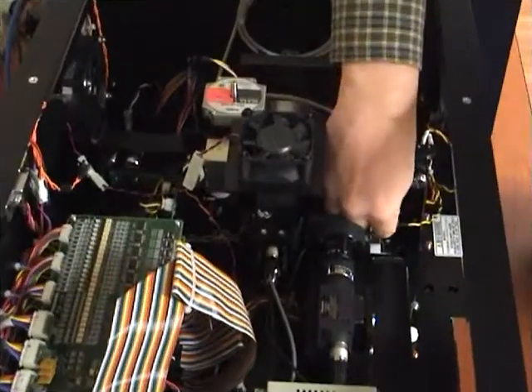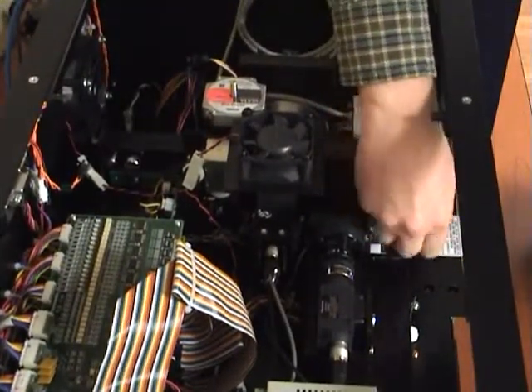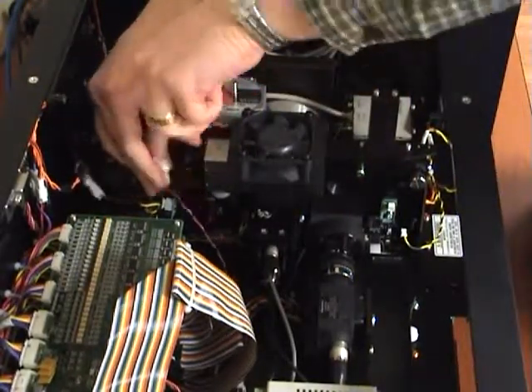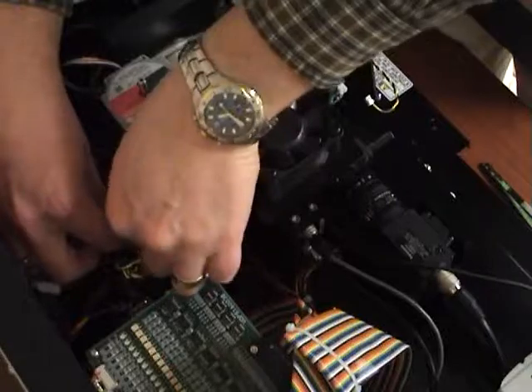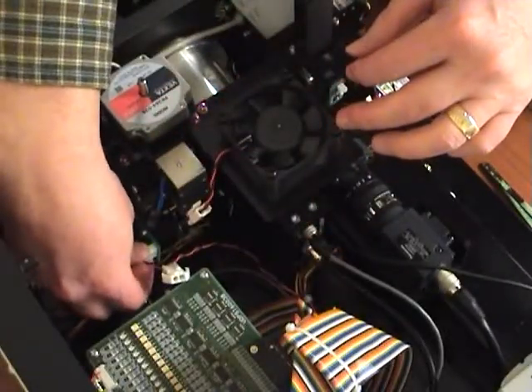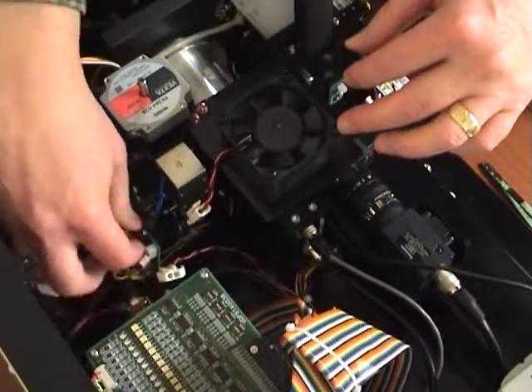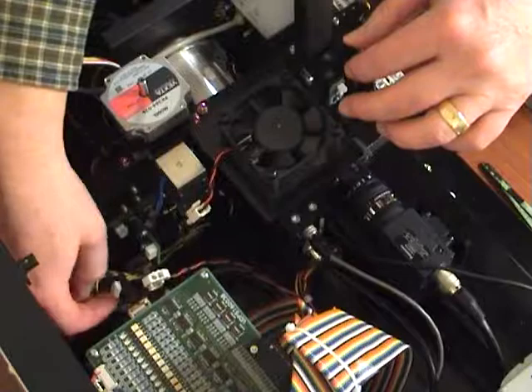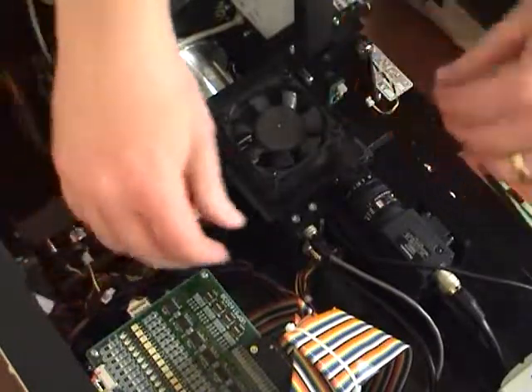Remove the PMT housing by disconnecting the necessary 8 wires. For readers with a PMT fan, as shown here, there is an additional connector for a total of 9 wires that need to be disconnected. Be sure to pull on the connectors and not pull on the wires. Pulling on the wires could cause the wires to break free from the connectors, causing the reader to become inoperable.